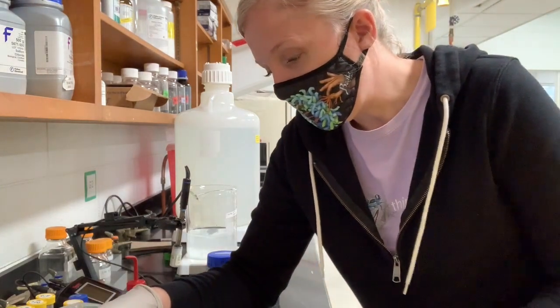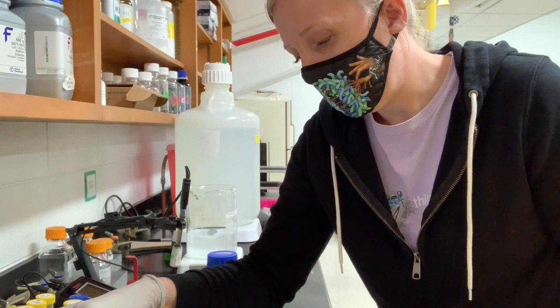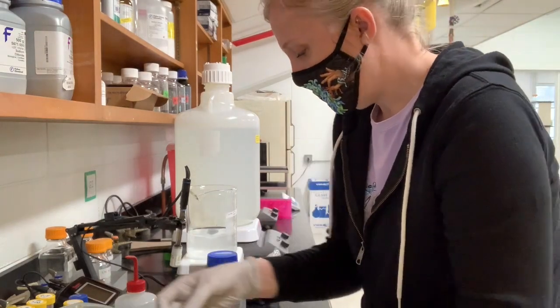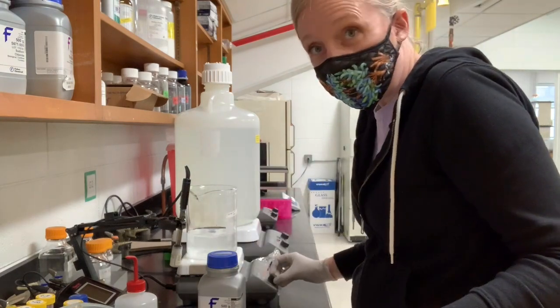Another thing I will mention is that when you're using these scales, be sure to clean up after yourself. If you have a spill anywhere, make sure you clean up very well. Okay, so that's my 2.01 grams potassium chloride. I'm going to pour that in. Going to turn up the stirring just a little bit.